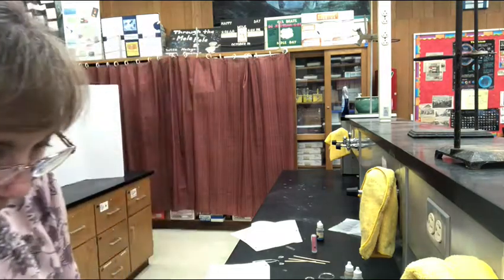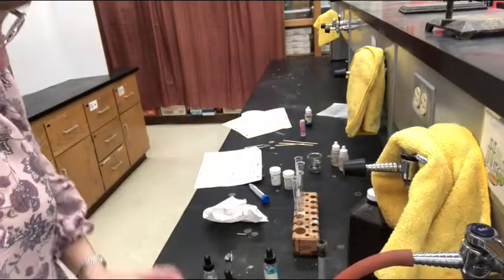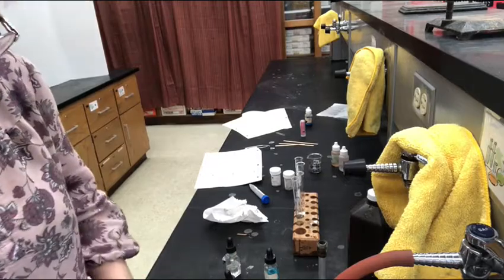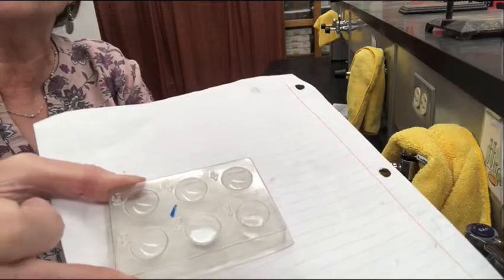So you can see they look just like drops of water. They don't look like there's anything in them, but when I put some salt water into the silver nitrate you can see it got kind of a milky white color. That's your observation.